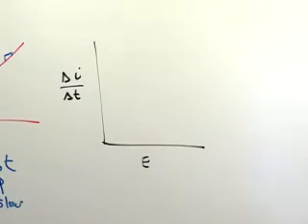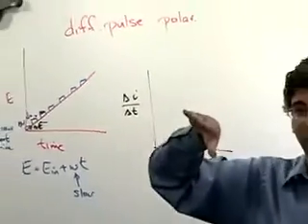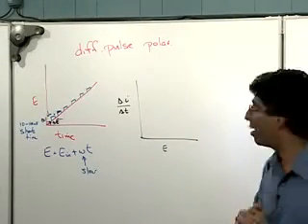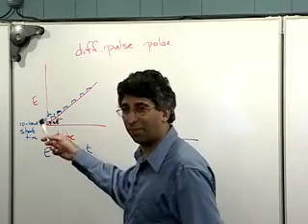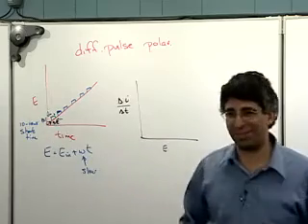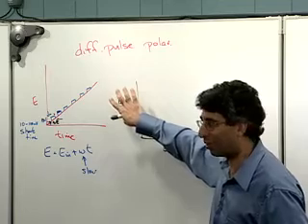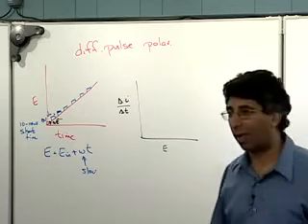And this does two things for you. First of all, by doing the subtraction, if you have an underlying baseline that's getting in the way, it automatically subtracts it out. And second of all, it enhances your sensitivity, both to actual signal and to noise, because now you're looking at this differential quantity, or something approaching a differential quantity here.